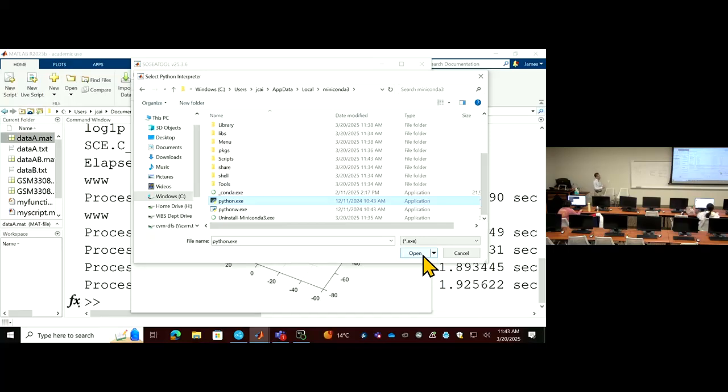So I keep on this page, just make sure you know where to find the path. You only need to do this once. Once saved, next time you still have this established. Unless you uninstall Python and replace it with something else, you may have two different versions of Python installed in parallel on the same machine. In that case, you may want to switch, then you just find a different version of Python through the change of the folder name.